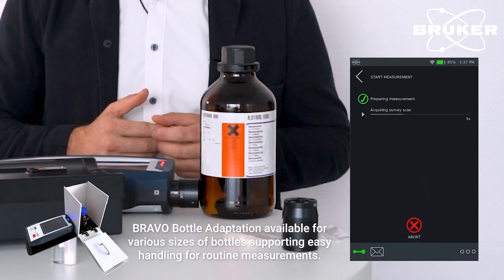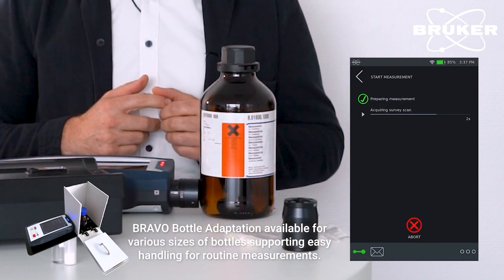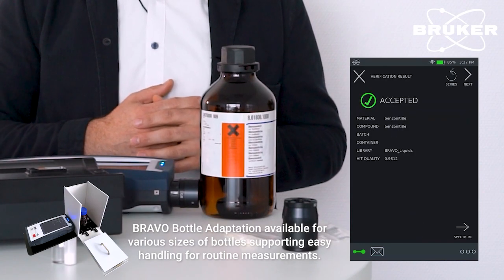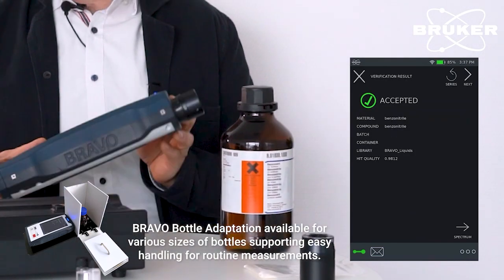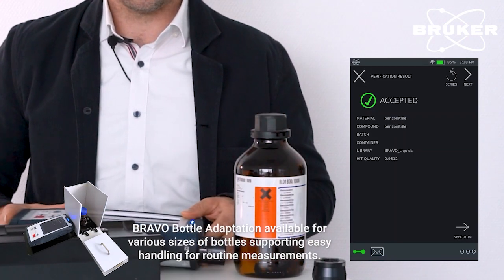Again, the measurement parameters are set fully automated. The measurement just takes a little bit longer because the amber-colored glass induces some absorption effects. So here's the result, accepted, it's benzonitrile included.